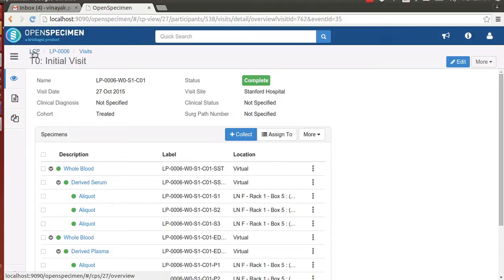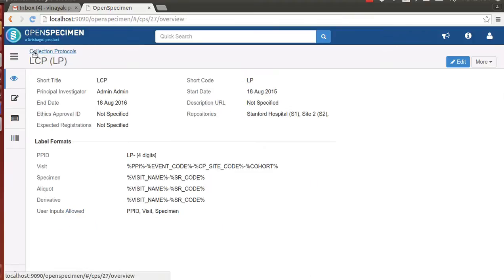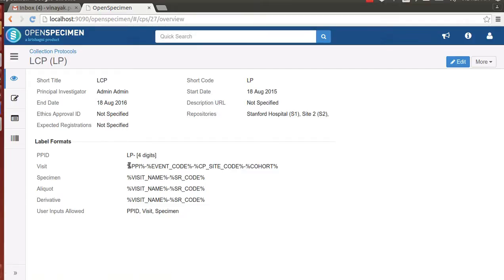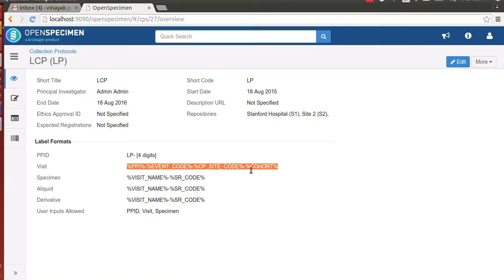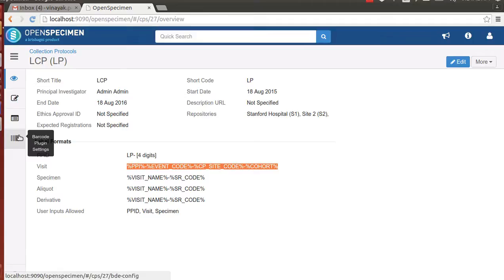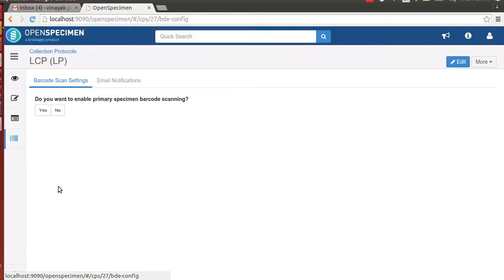Now let's go into the details of how to configure the clinical barcodes. The clinical barcodes are configured at the study level as shown on the screen. Each of these components are customizable. The clinical barcode is totally customizable. The order in which the component needs to be input is again customizable. The plugin has its own configuration settings which appears as a tab in the study details page.